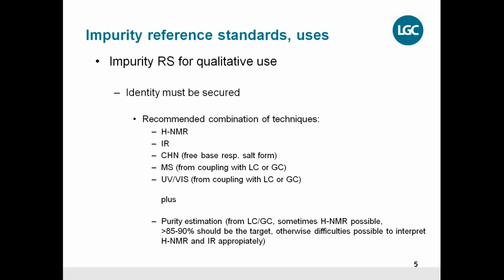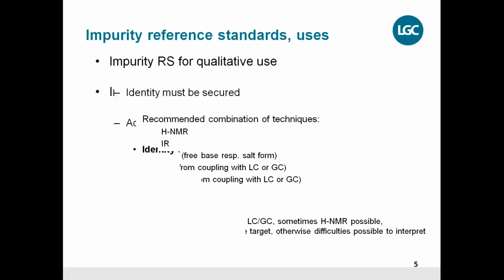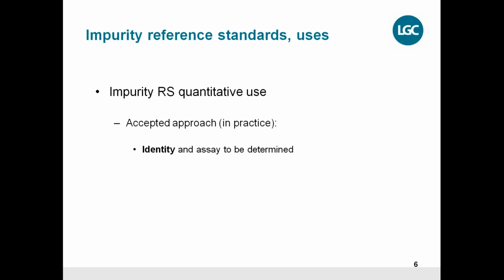Okay, so that is about it for the qualitative use. When you want to set up an impurity reference standard for quantitative use, an accepted approach that we see working in practice very well, because we characterize our materials like that, and we know from our customers that they are used very often in dossiers and are always well accepted there. That accepted approach I would like to show you now.